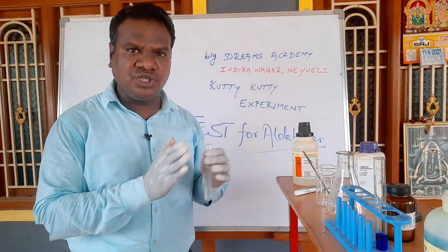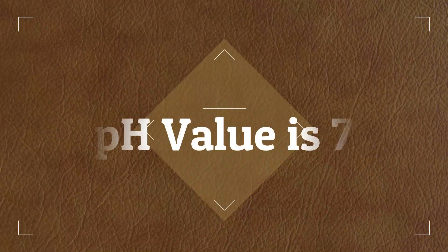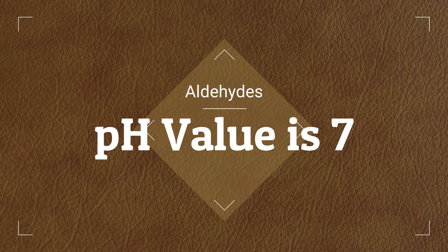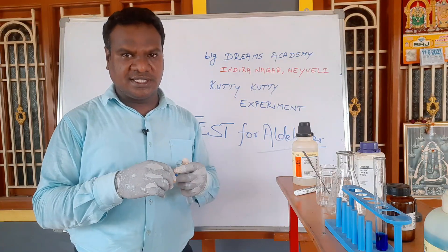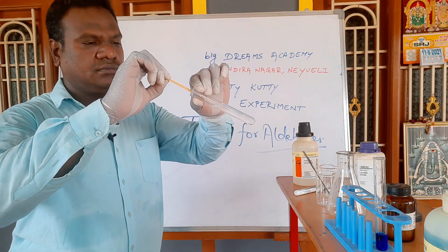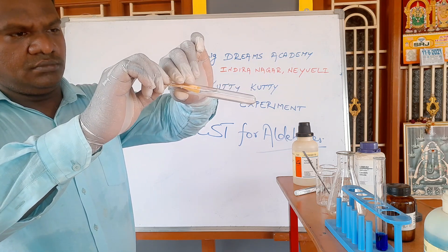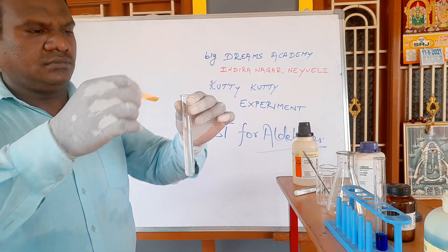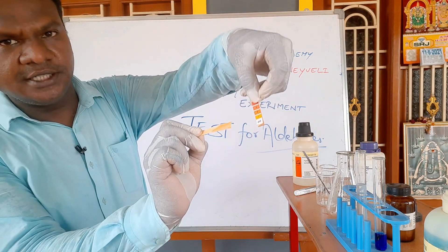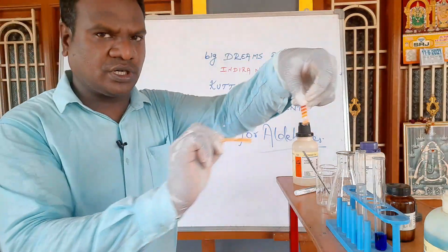Aldehyde is pH neutral. Let's try to test it. The color is nearly neutral — around pH 7. This neutral solution appears orange in color.